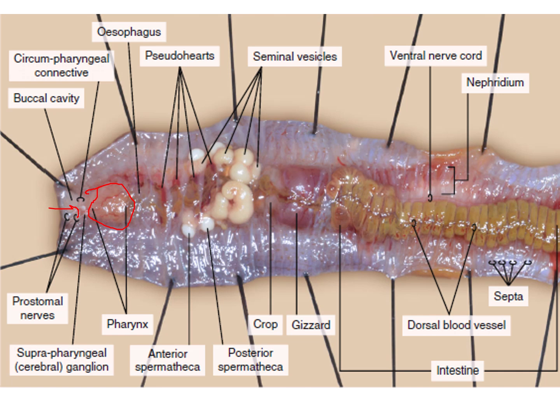And the dorsal blood vessel is observable on the dorsal side of the intestine. These chloragogen cells work like the vertebrate liver, and they store glycogen and lipids. Their function is like the liver.